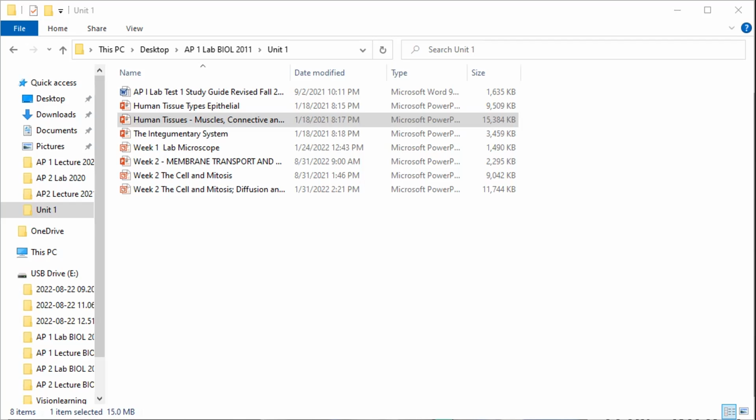Okay, this is our small intestine again, a better close-up of this. When I said that there were 2 layers of muscles in the small intestine, you can see them here. This is the outer covering of the small intestine. That's the serous membrane I mentioned in lecture when we wrapped up chapter 1.